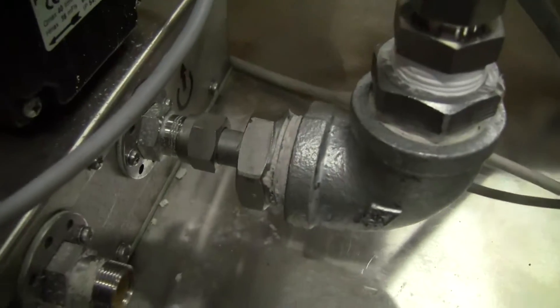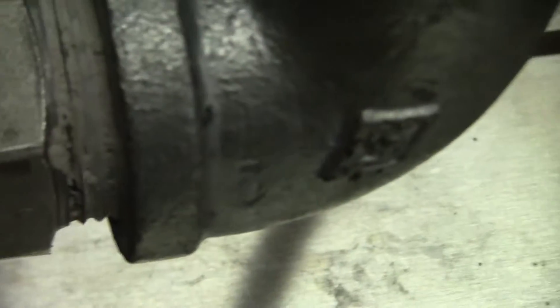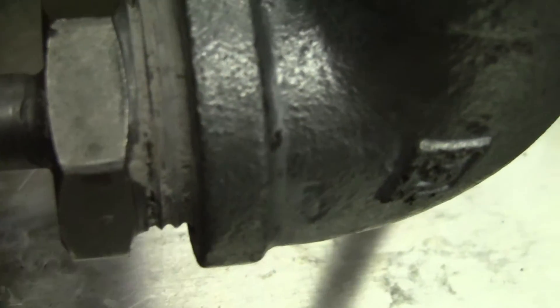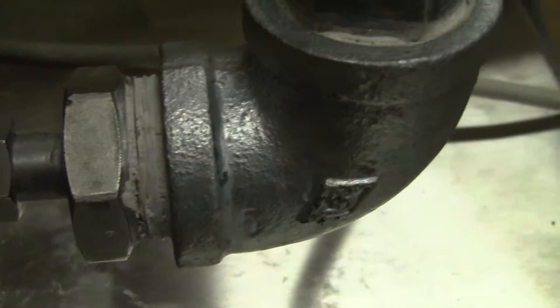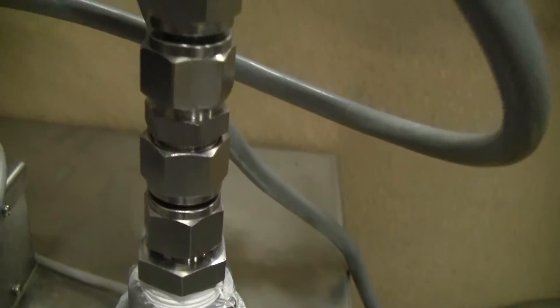Good afternoon from HiTech Trader. Here's the Julabo fitting that we had to use. They are welded to this one inch piping, then it goes from the one inch to all half inch fittings.